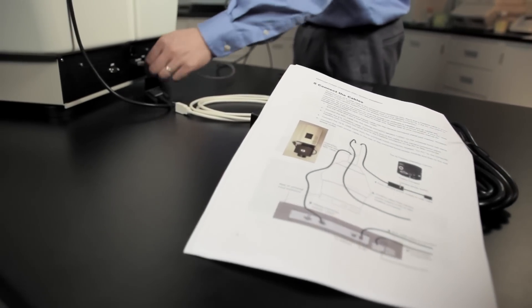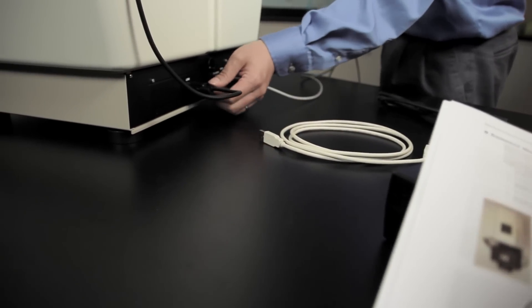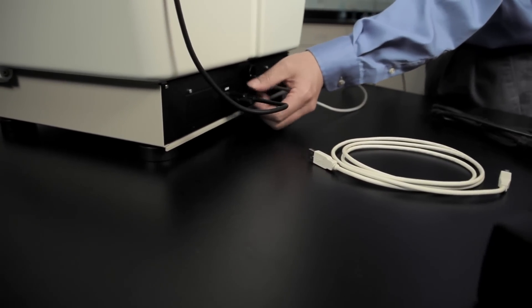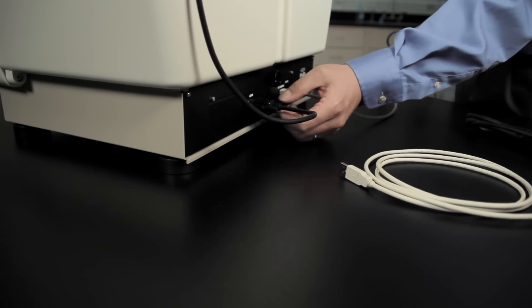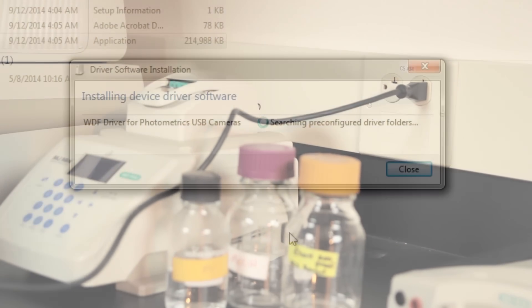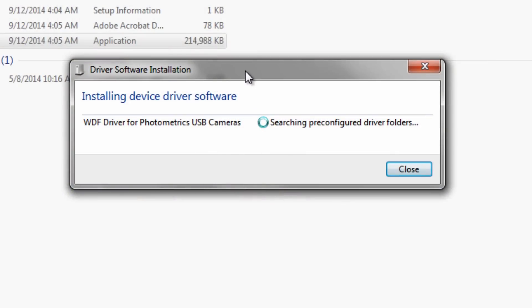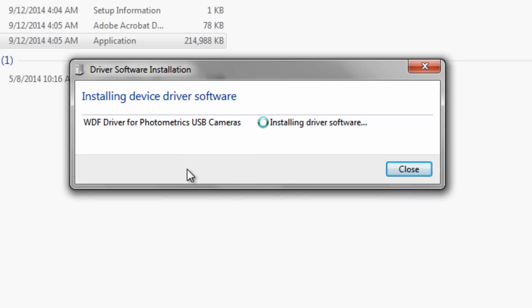Following the diagram in the installation guide, connect the lens cable, camera power supply, camera USB cable, hood USB cable, and hood power cord. Plug the ChemiDoc camera power supply into an outlet. A driver software installation wizard will appear on screen. Follow the on-screen instructions to install the driver.